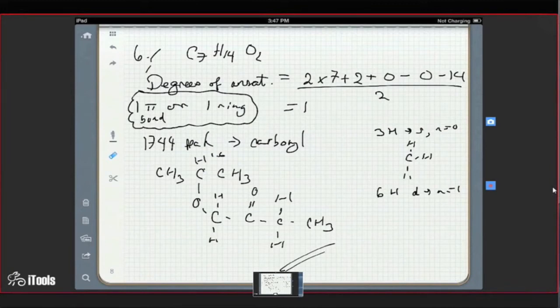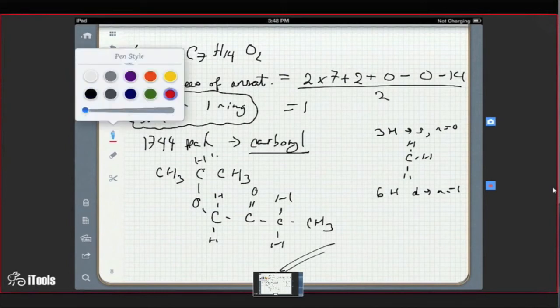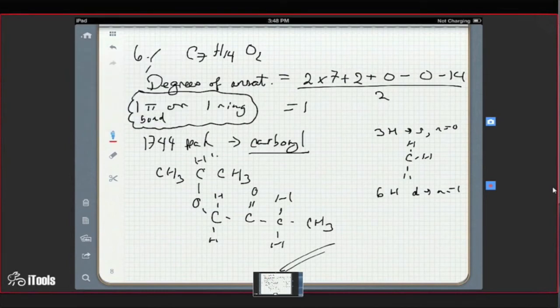Remember that in your table, they give you the precise absorptions for different types of carbonyls: ketones, aldehydes, esters, and amides, right? So that actually would give you a stronger clue here. So you guys were trying to figure out whether the carbonyl was a ketone or an ester, right? Well, according to your table, where do ketones absorb?